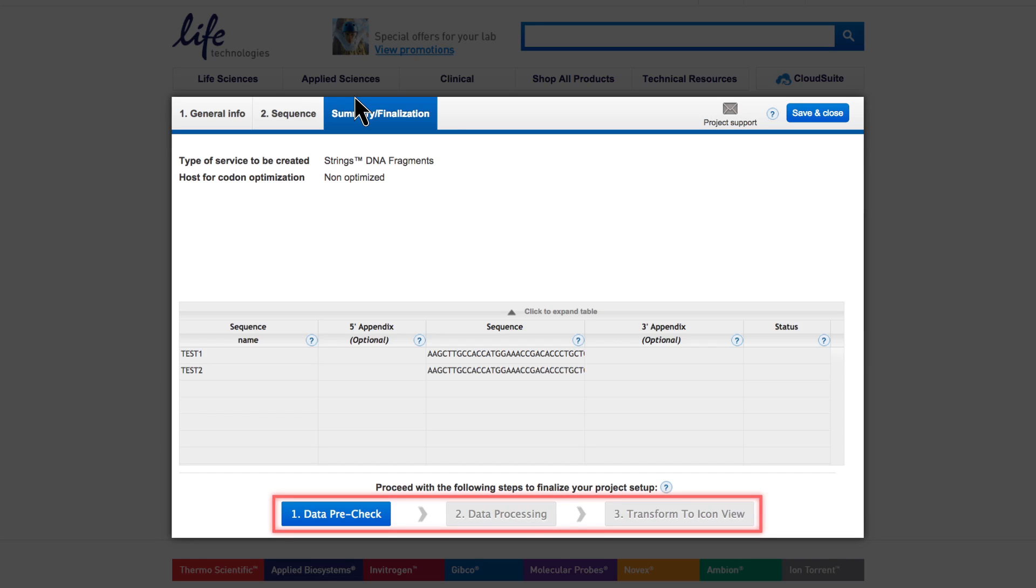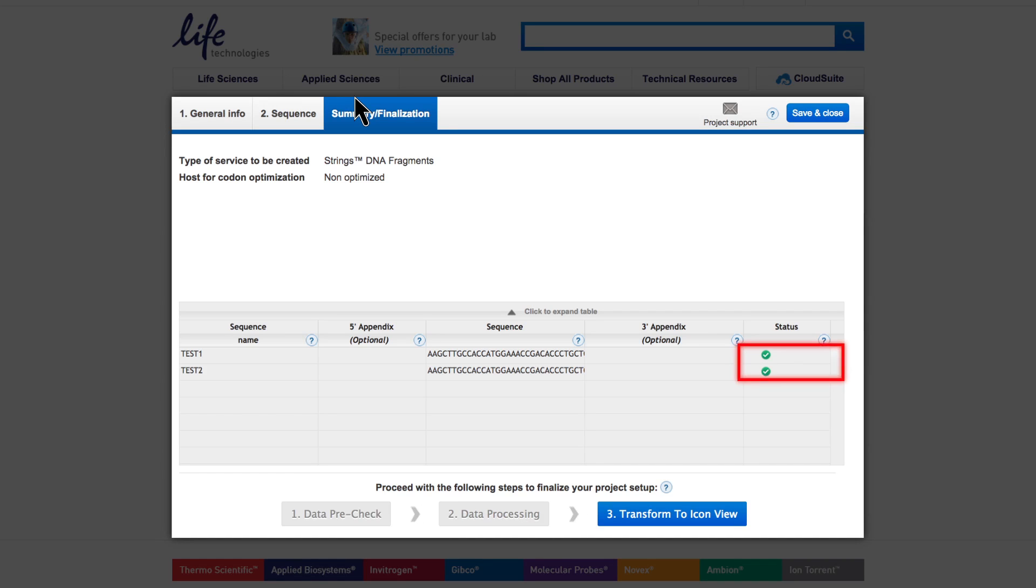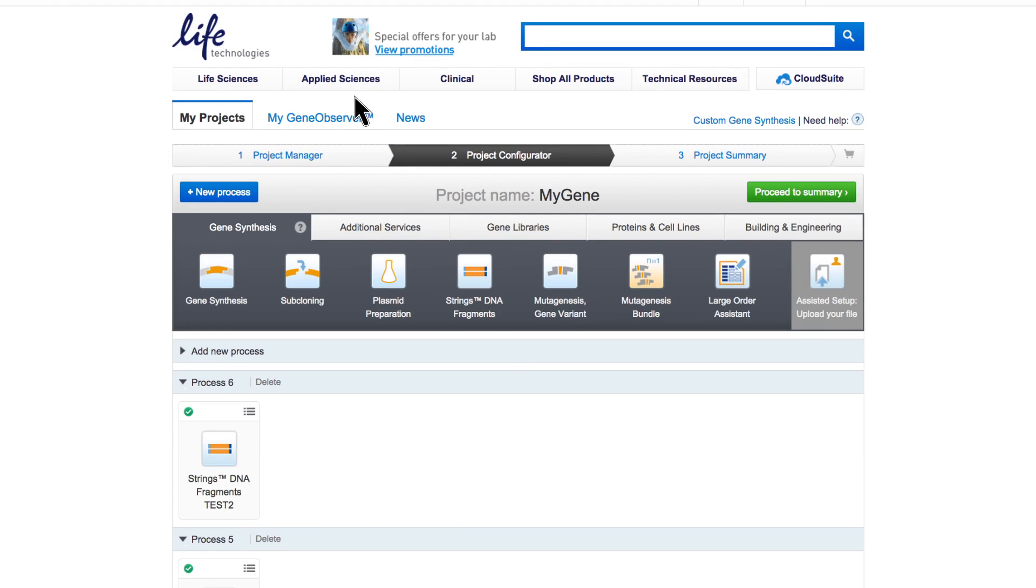If required, you can click Save and Close at any time and continue later with your order. Again, check that all line items have a green flag, confirming the integrity of all data before generating the icon view. You can directly click on Proceed to Summary from there.